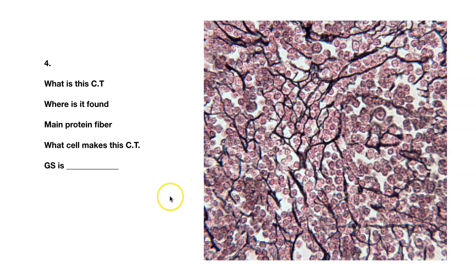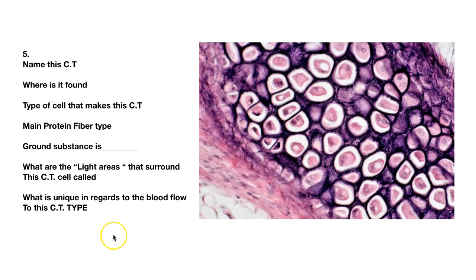So that was slide number 4. Slide 5. Name this connective tissue right here. Where is this particular connective tissue found? You should know at least 2 places.